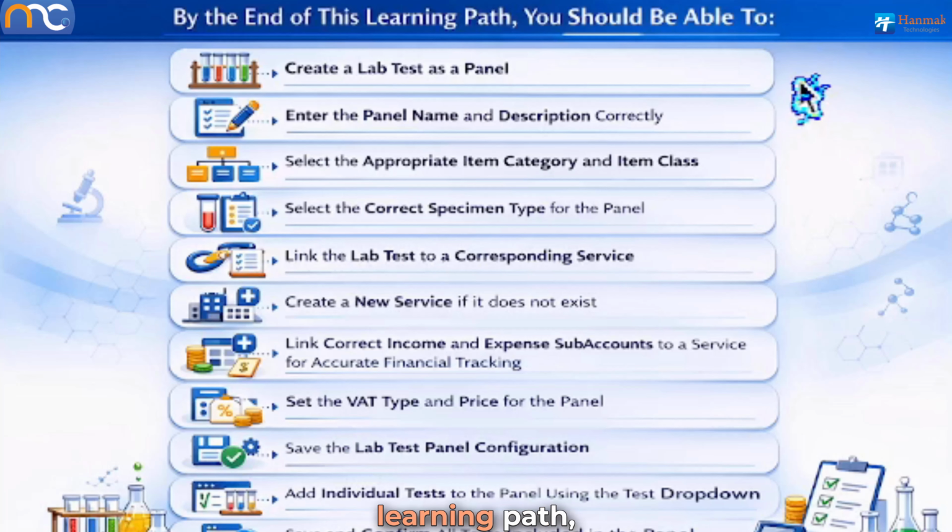By the end of this learning path, you should be able to create a lab test as a panel. Enter the panel name and description correctly. Select the appropriate category and item class. Select the correct specimen type for the panel. Link the lab test to a corresponding service. Create a new service if it does not exist. Link correct income and expense subaccounts to a service for accurate financial tracking.